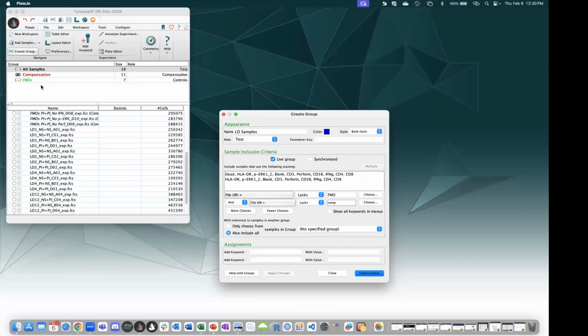Before I start directly to the analysis, I just want to make sure that my first label is entered correctly.